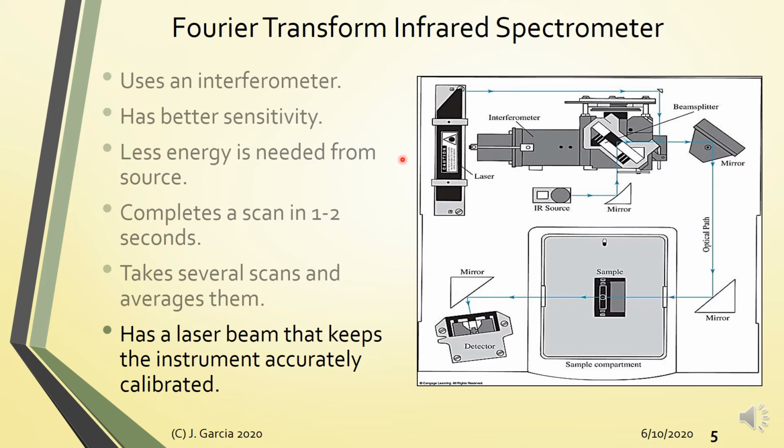And also water. Water is a no-no when it comes to FTIR. Bakit? Dalawang bagay. Una, malakas ang signal ng water sa IR spectroscopy. So mangyayari doon, masasapawan lang yung signal. Okay? In my experience, even if you do background correction, kunwari gusto mo mag-attempt ng aqueous sample, and then gagawin mo parang sa UV-Vis.